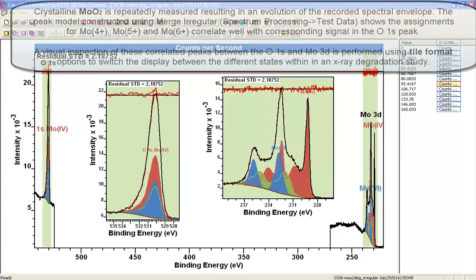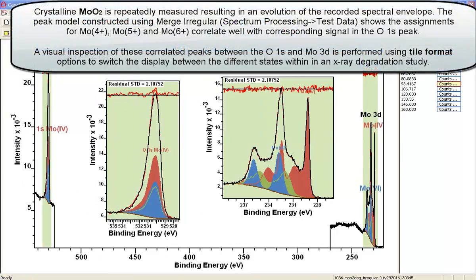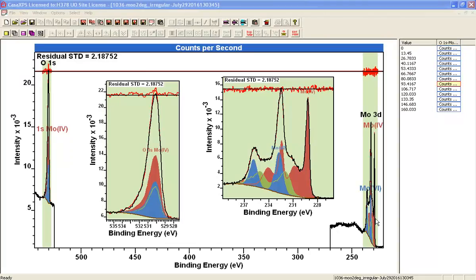These VAMAS blocks have been created by merging using the irregular option, two spectra: one measured at oxygen 1S and the other at molybdenum 3D energies. In order to see these clearly, I've created two insert tiles. The idea is that I can display the oxygen peak here with a bit more detail, and similarly the molybdenum 3D is the same as this one you see here.